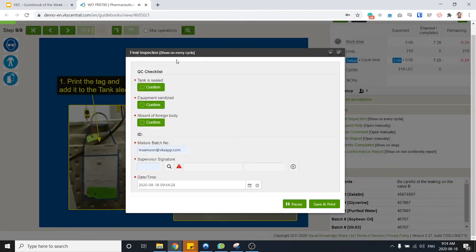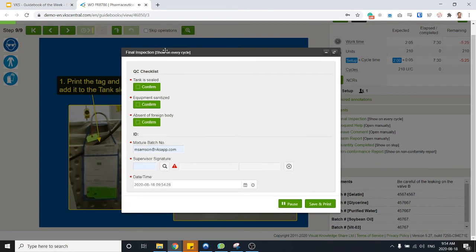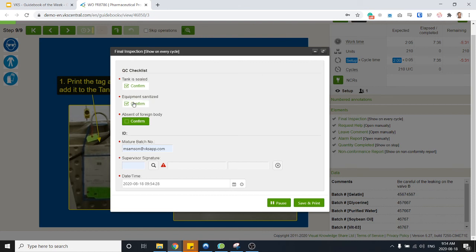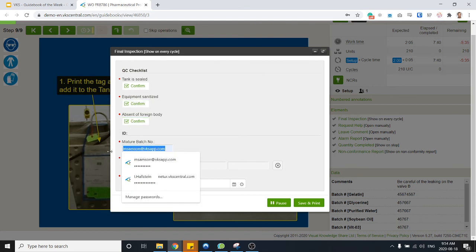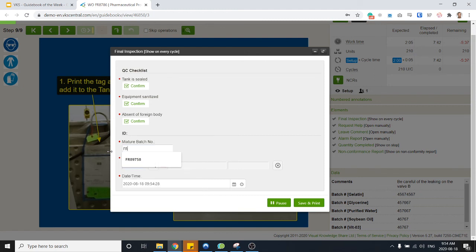I'll just move over. Then I've got the final inspection that I've got to fill. Checklist: tank is sealed, equipment is sanitized, absent a foreign body, let's go. Mixture batch number, let's remove that from pre-fill, add the actual batch number, making sure it matches whatever we're working on.